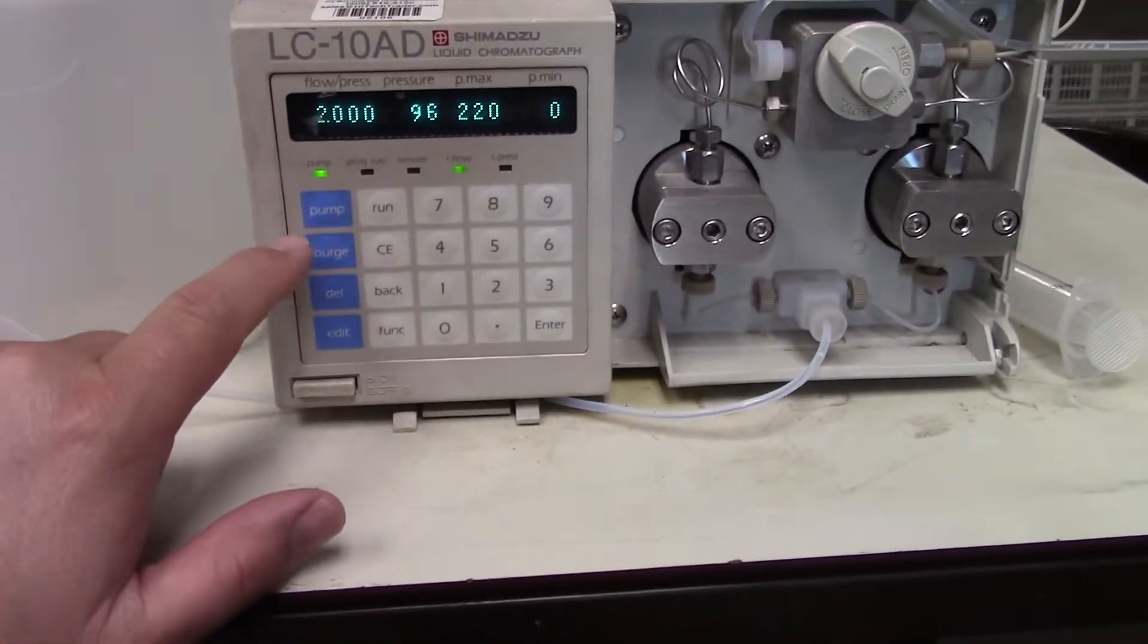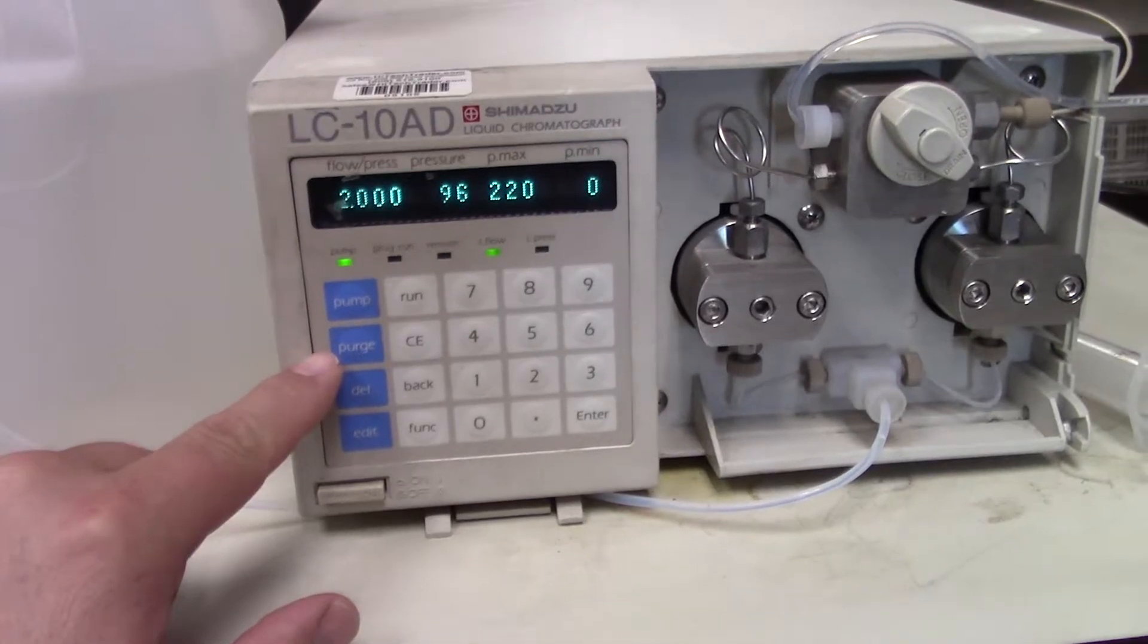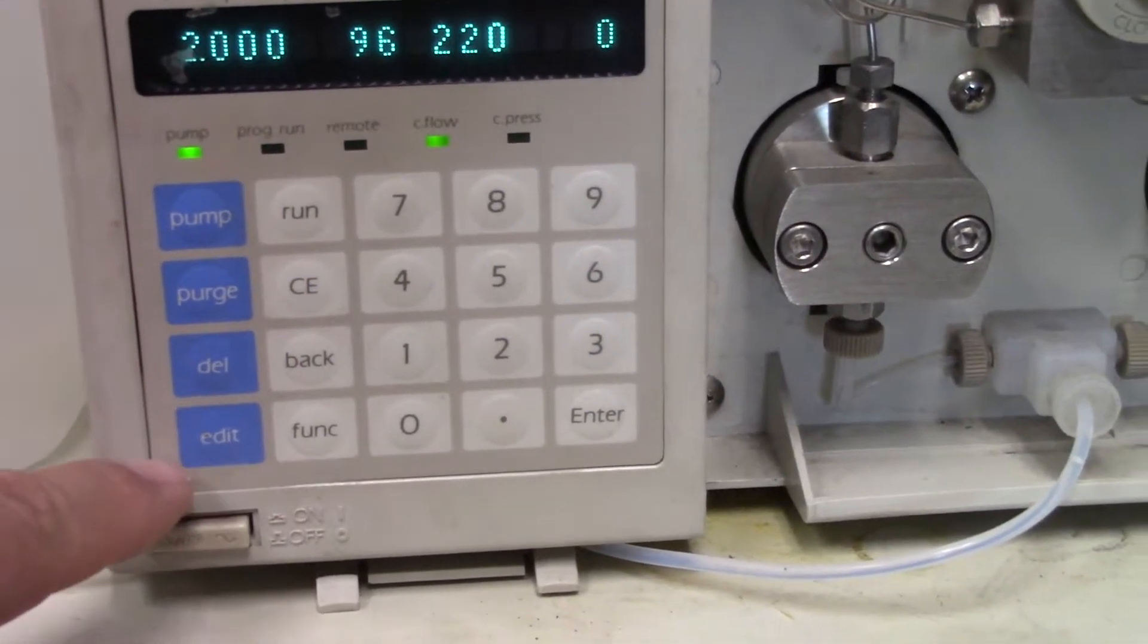Power button, pump. I'm going to zoom in there. Power button, pump, purge, delete, edit.